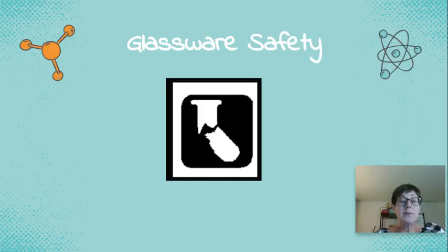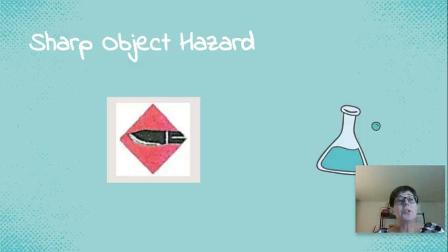Glassware. We do have glassware, beakers and Erlenmeyer flasks and test tubes. They will break when you drop them, or if you set them on the counter too firmly, they will break, so please be careful.